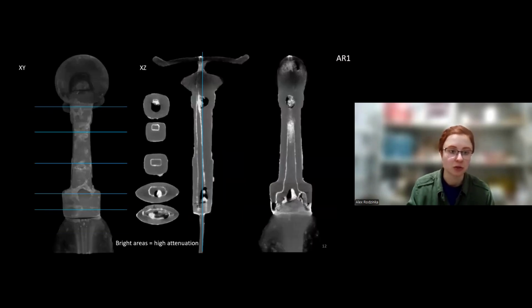And then the third example is the sword on top, also bimetallic. And here you can see the glue very well. You can see it has this liquidy appearance. And you can also see a thin layer of corrosion on the surface of the iron inside, as well as the corrosion that's much more intense where there is a hole, probably a casting flaw in the iron. And the interesting thing you can see as well is where you have that iron tang, where there is that original casting hole, it's very corroded. But then you look closer to the blade, you have no corrosion where there is a gap, because that gap is a modern gap. So there was no time for the corrosion to happen.